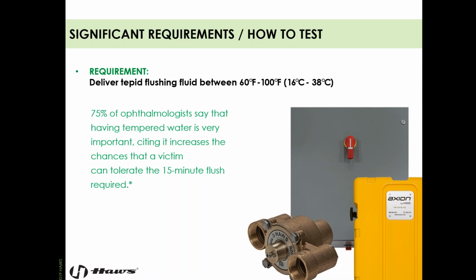One, this temperature range is unlikely to affect any chemicals that may react negatively with hot water on your body. It will encourage the user to tolerate and stay inside of the shower. If it's too cold or too hot, it may push them out of it. And there's a lot of different ways that we can accomplish this using things similar to the tools on the right here. You can mix hot and cold water if you have it available.